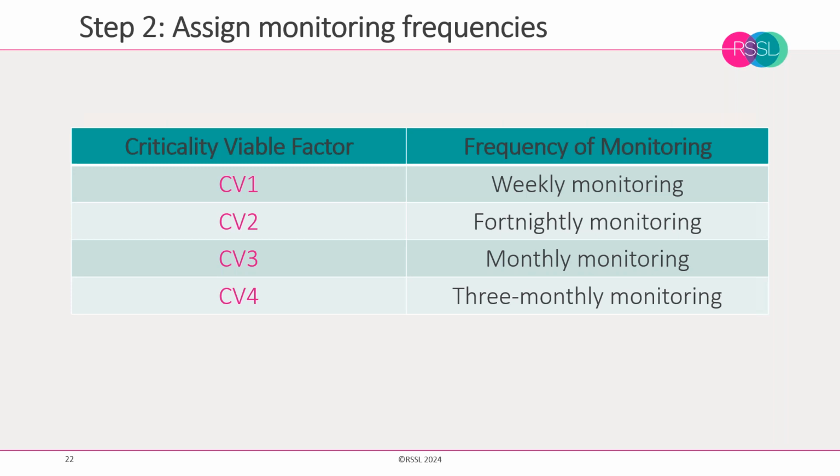These are the ones where we need the most direct information about the risks of the product. Others can be done fortnightly or every 2 weeks. Others monthly, and then there's a few very low risk grade D office areas, cupboards and things that probably would meet a 3-monthly monitoring regime.